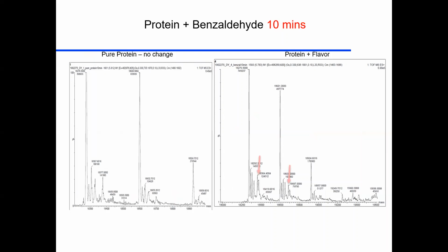Now, maybe I take that same protein and I go ahead. And so this is the same mass spectrum. It's now half of it instead of the whole one. This is half, shrunk. Well, beta-lactoglobulin, lactose added 2 lactoses.